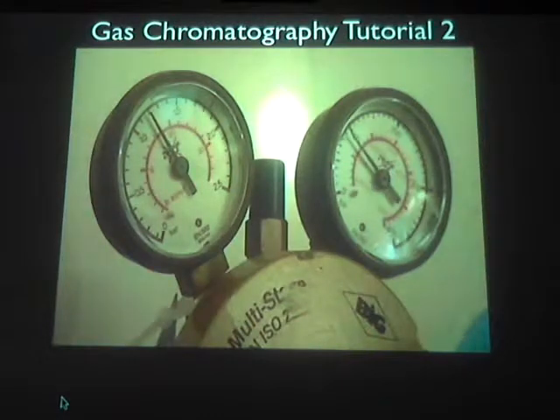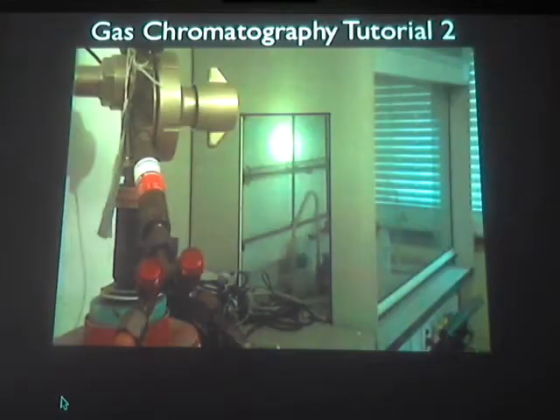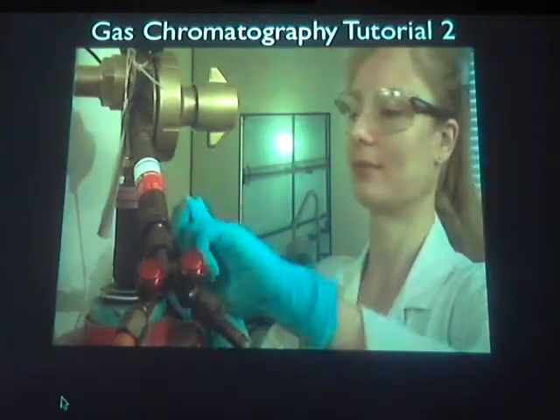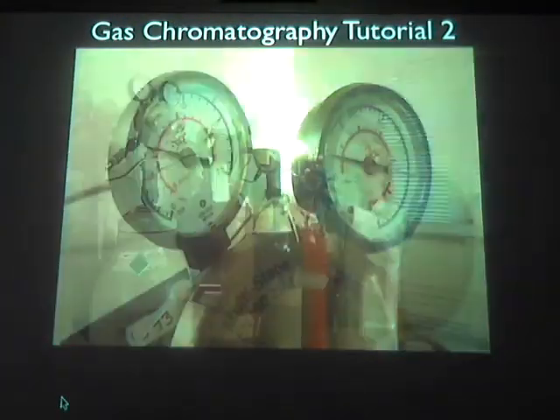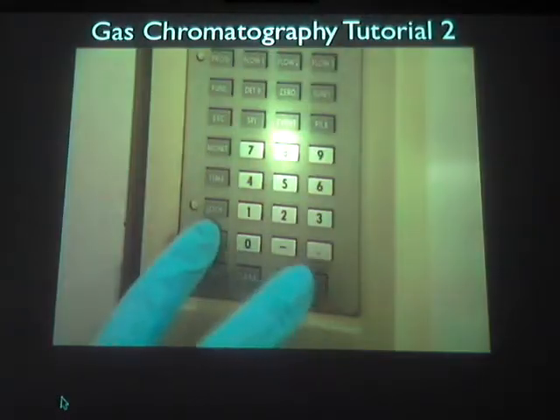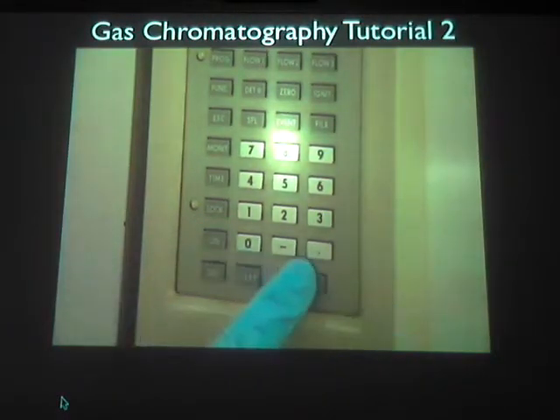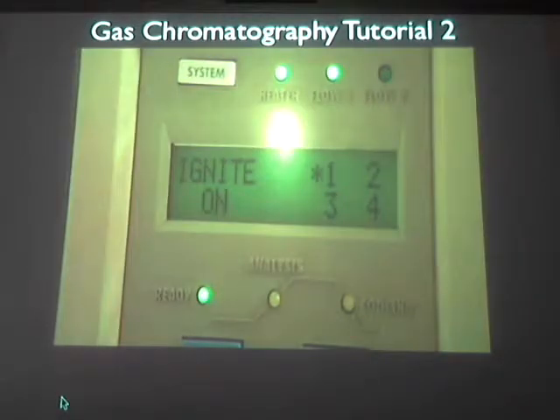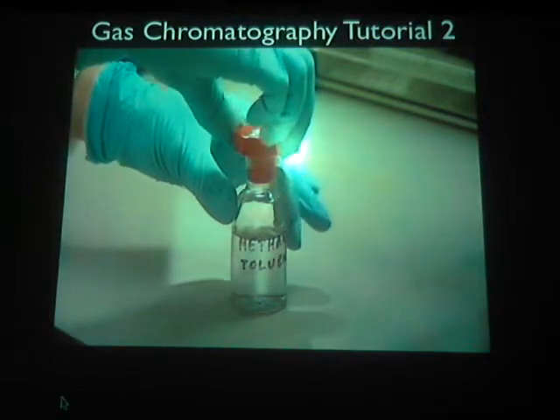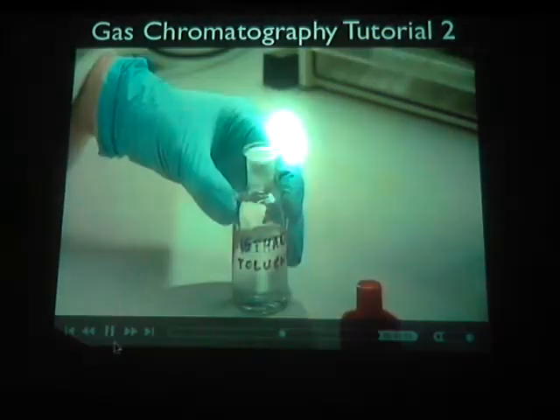Before beginning a separation, the operator must set the flow rate of the gases and the temperature of the oven. The temperature of the inlet port is also set at a level that ensures that the sample is fully vaporized, and the flame ionization detector must be lit. Here, we will separate a mixture of methanol and methylbenzene.